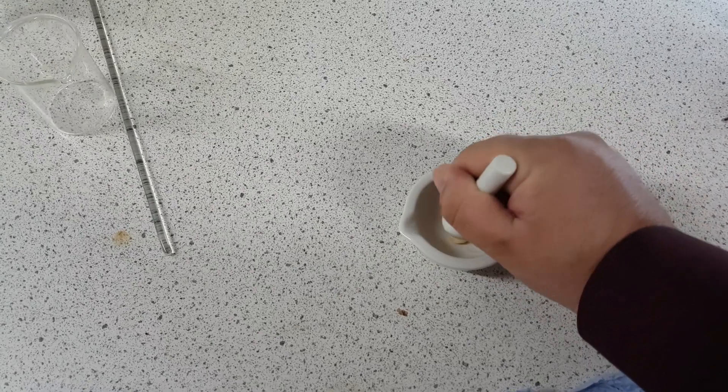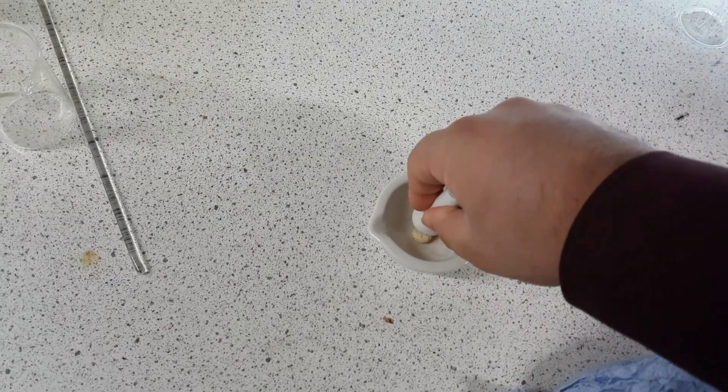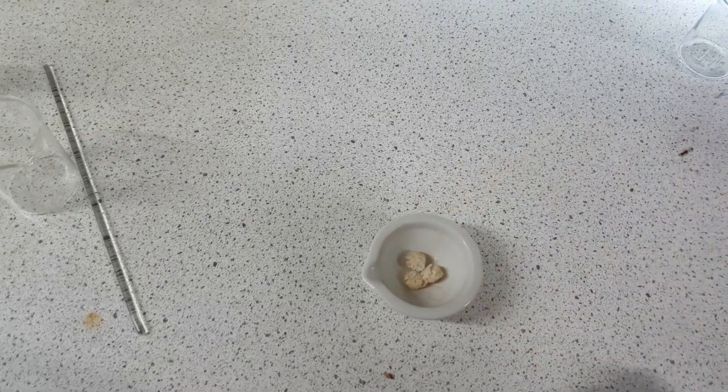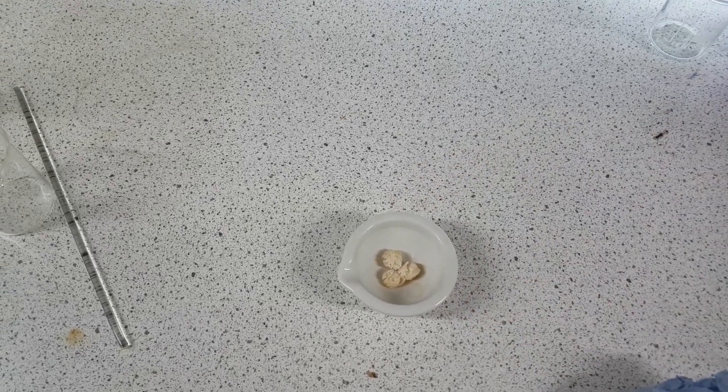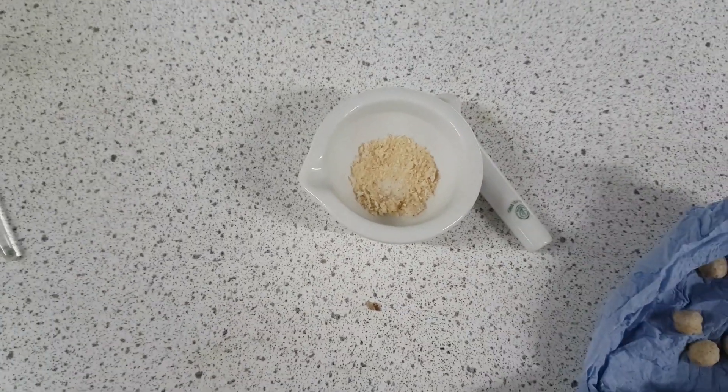Basically what you're going to do is if it's a solid like this, you want to use the pestle and mortar to kind of grind it down. Use these two to grind it down if it's a solid. I'm going to do that now. So I've grinded that down into smaller pieces, as small as I could get it.